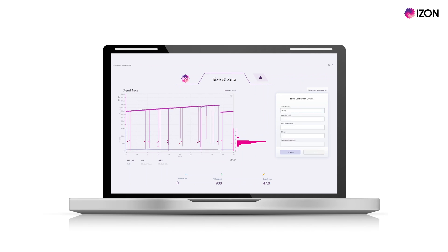Fill in the details of your calibration particles. The calibration charge will be automatically filled in based on the size of the particles you are using. Click done to proceed.